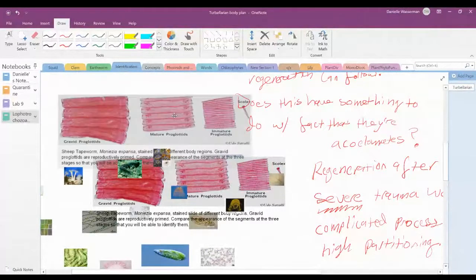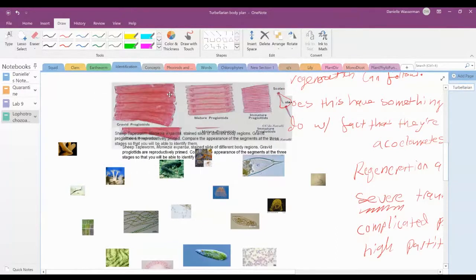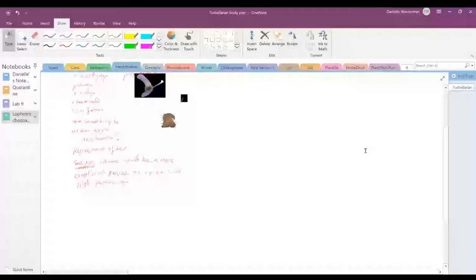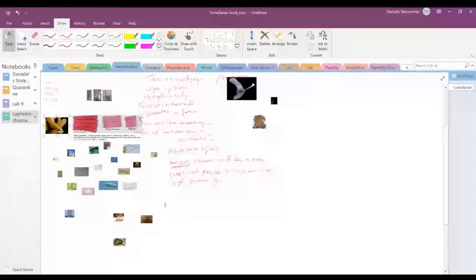a whole other phylum. Well, actually, no, I'm not sure. Is it a phylum? I think it might be a flatworm as well, but it is not a Turbellarian. So this is a tapeworm, and we did this on the same day. And if you do a focused piece on planarians and skip over Cestoda, that's okay. If you're missing both, then hopefully you're compensating by looking at something else that we did that day in a lot of detail.